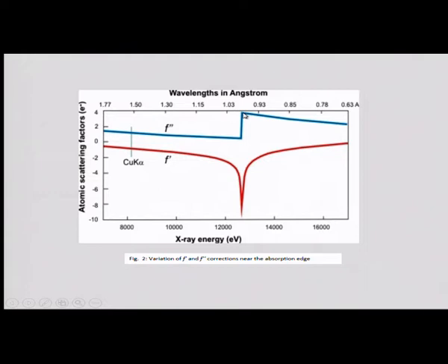At this point, called the peak wavelength, we can have thousands of Bragg intensities where the intensities of h k l reflection will not be equal to h bar, k bar, l bar reflection. So, this is called the Bijvoet difference. By feeding these pairs as coefficients in Patterson, I can get the position of the heavy atom.